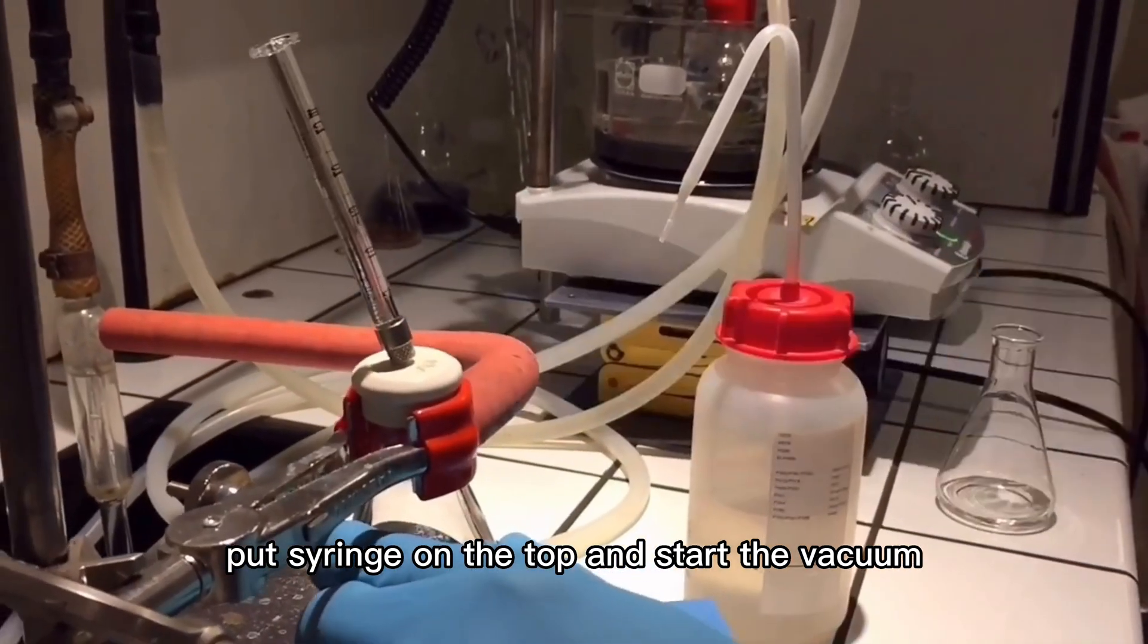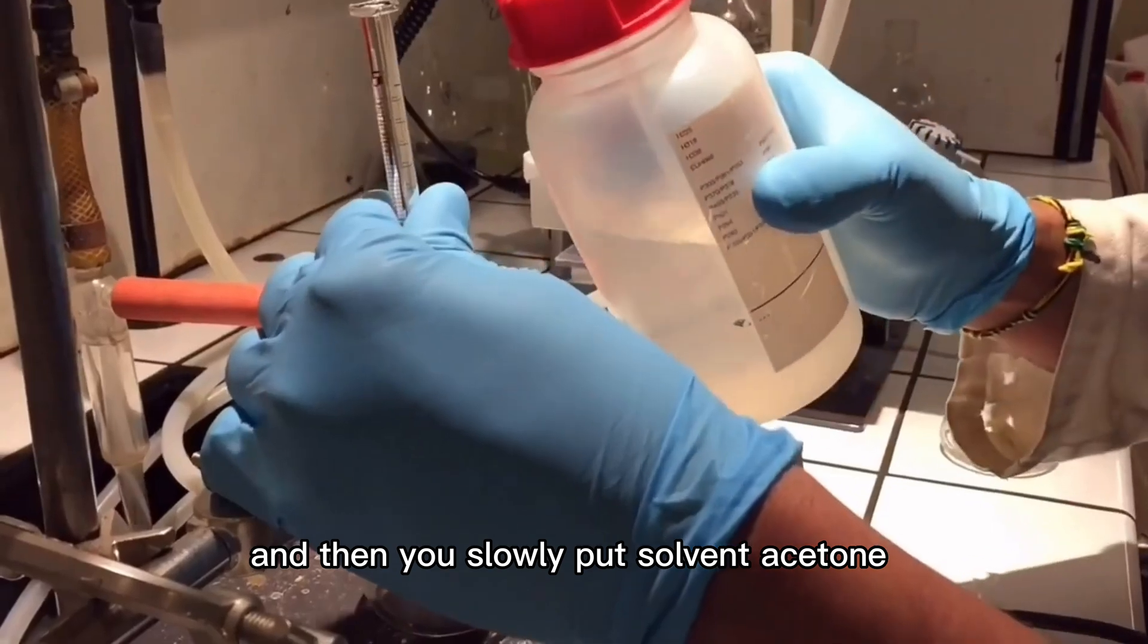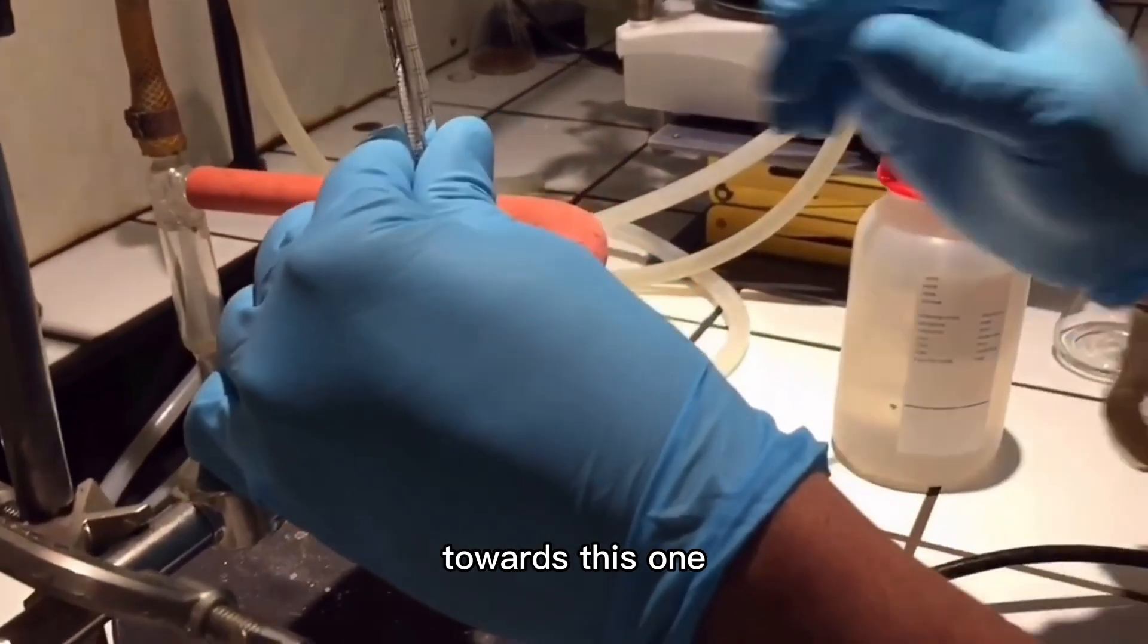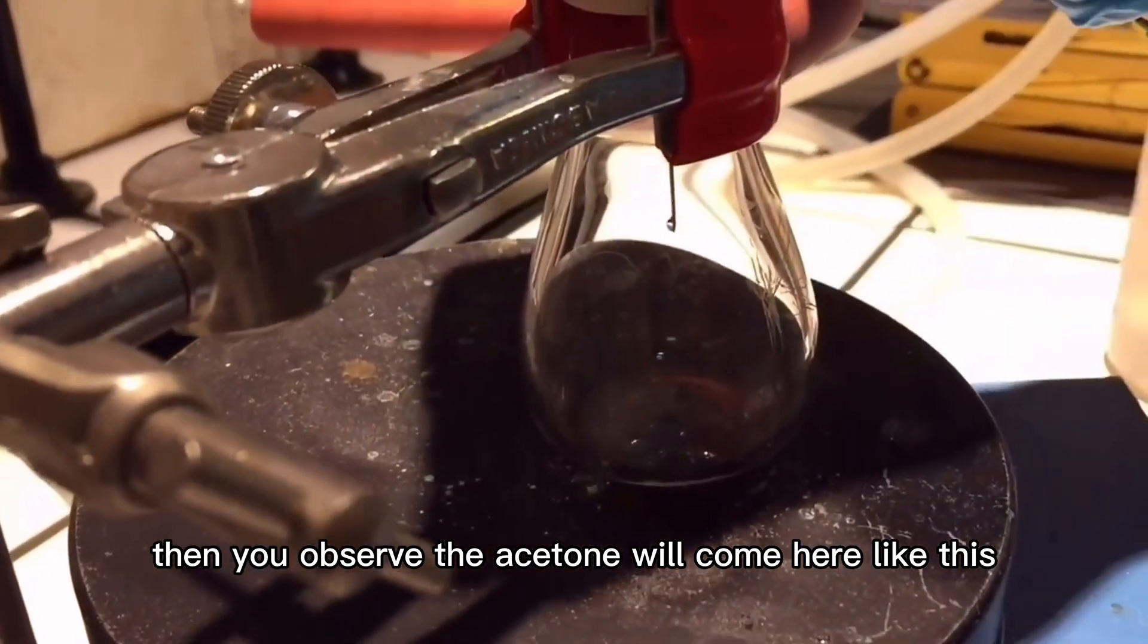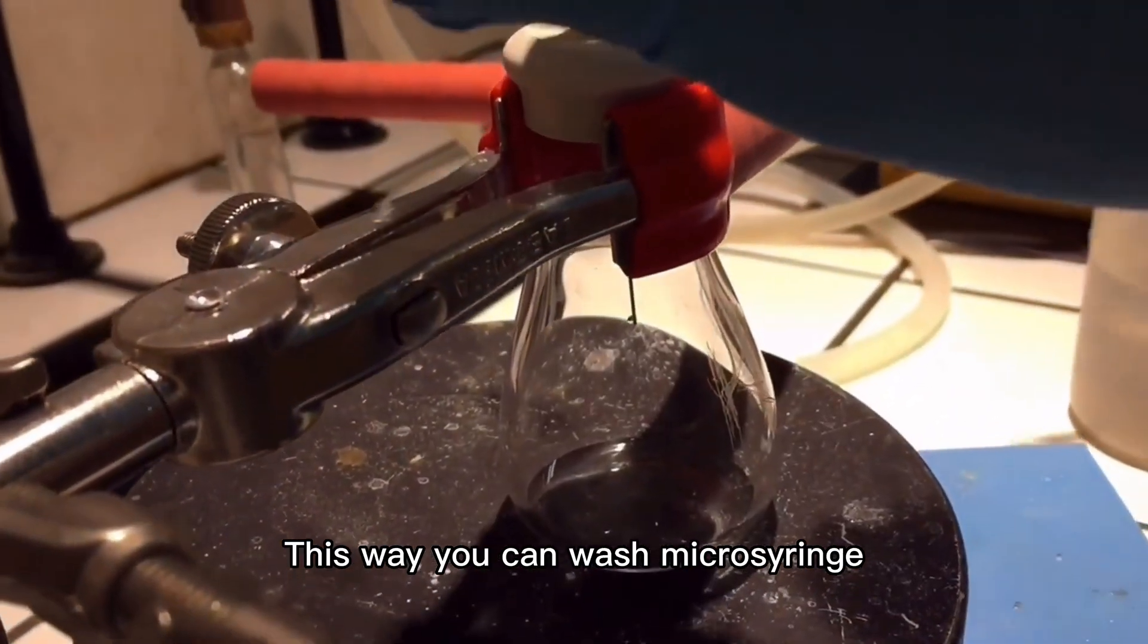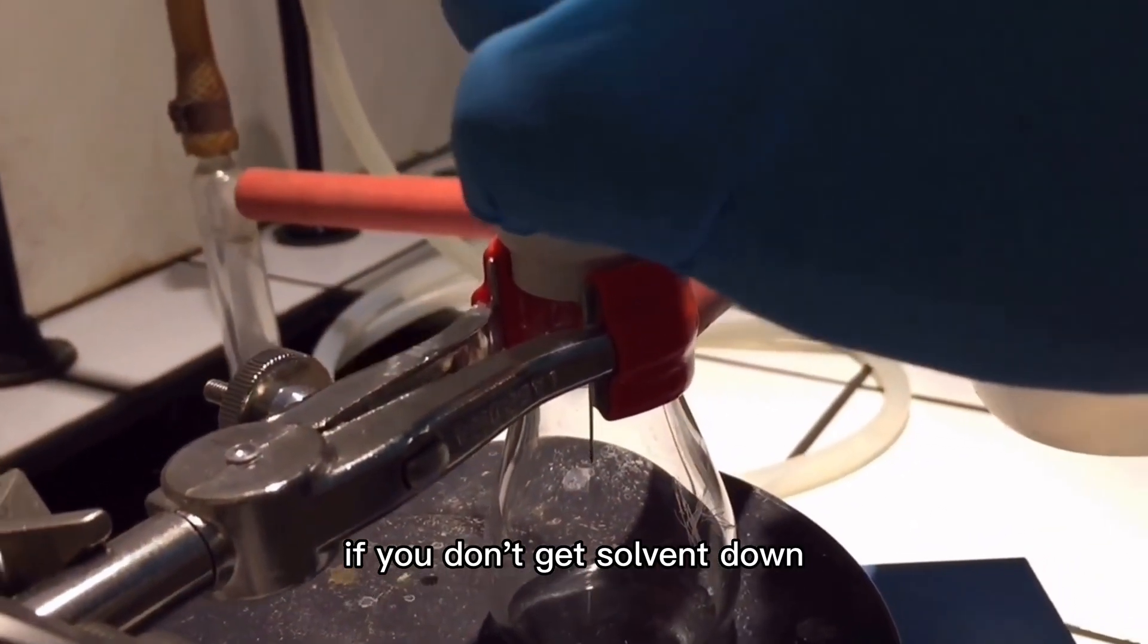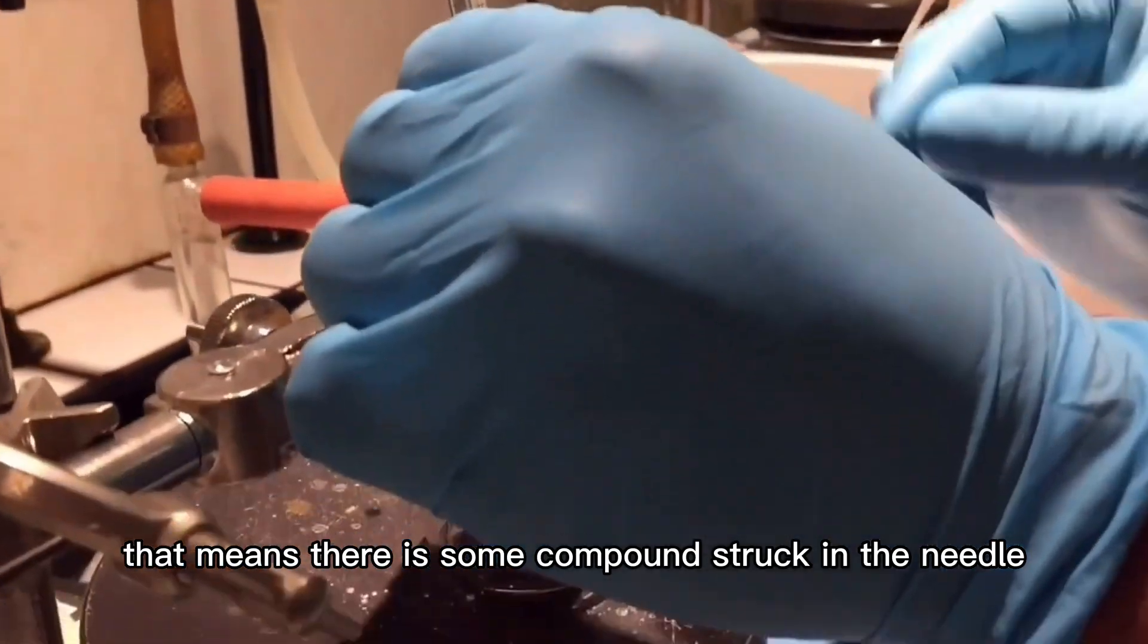Start the vacuum, then slowly put solvent acetone towards this. You'll observe the acetone will come here. Like this, you need to wash the micro syringe. If you don't get solvent down, that means some compound is stuck.